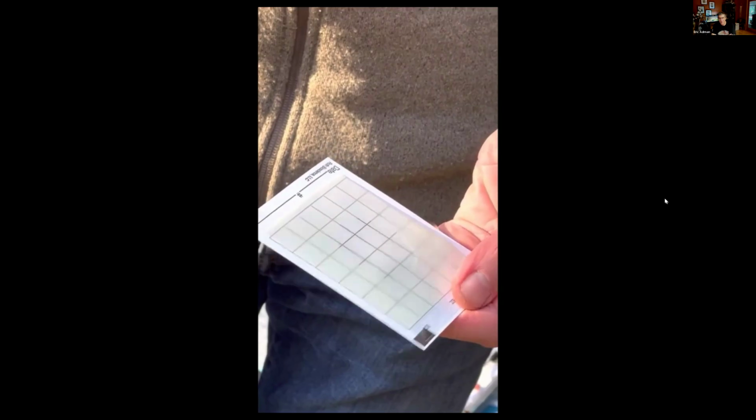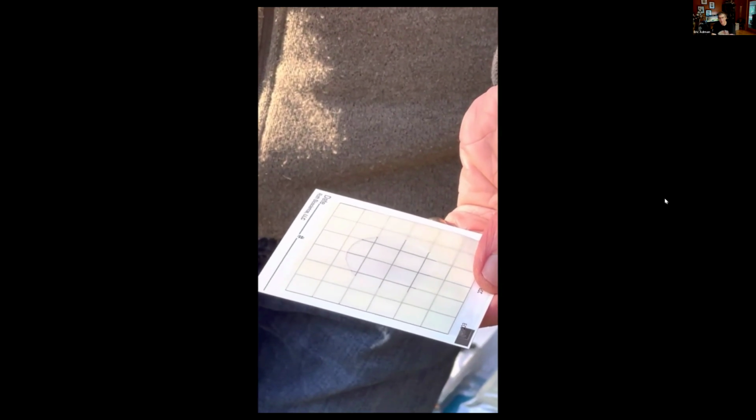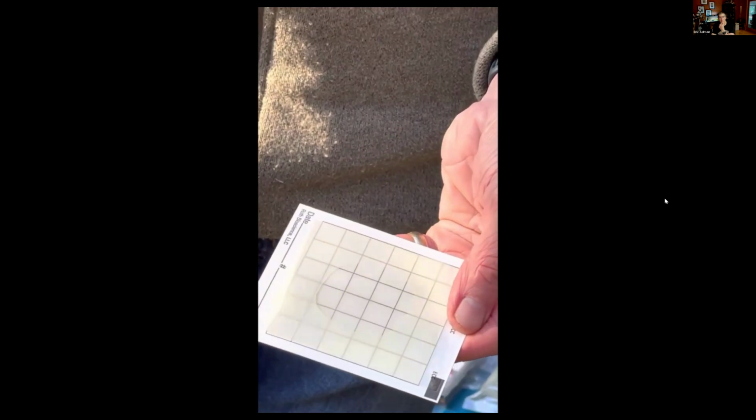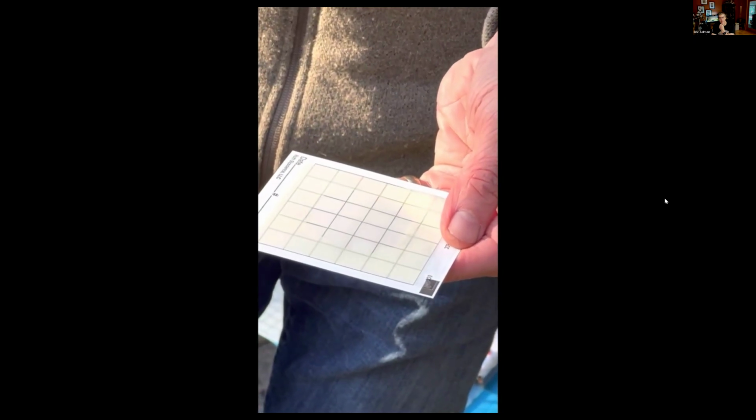And you can see that if I tip it, it does go in a certain direction. So if I don't hold it level as it spreads out, it's possible it could go beyond the edge of the card. But at a certain point, it just quits spreading out. And you're safe to collect another sample and plate another sample.